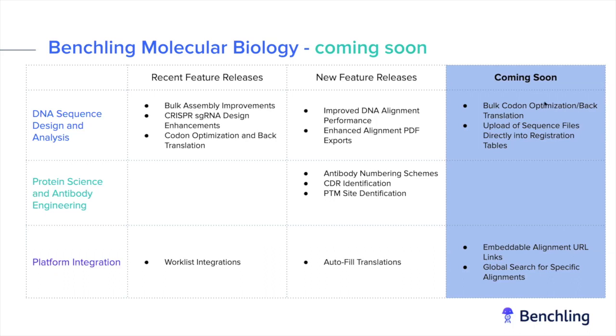So outside of the items that I've listed here that are coming soon, we are also going to be focusing on two different areas of work in the next 2 quarters or so that I want to mention. One is around certain enhancements to our bulk assembly tool, and this is initially going to include bringing over some aspects of our discrete assembly wizards into our bulk assembly tool.